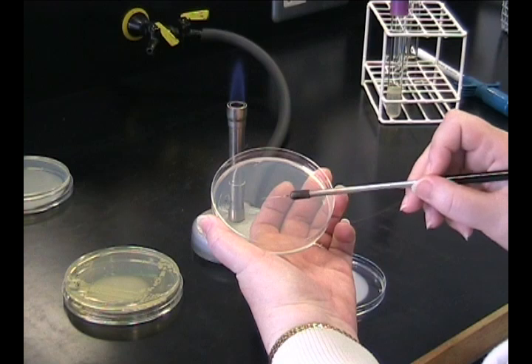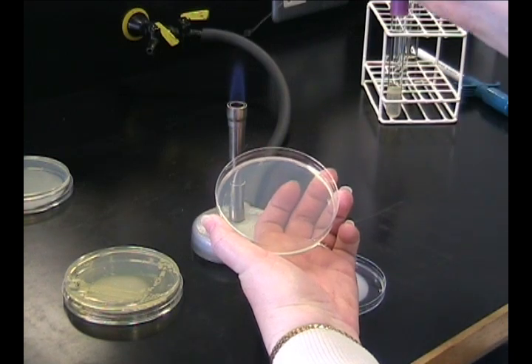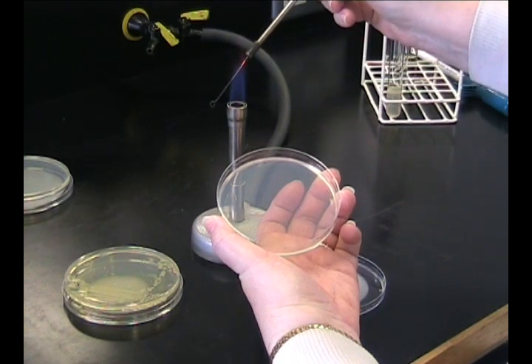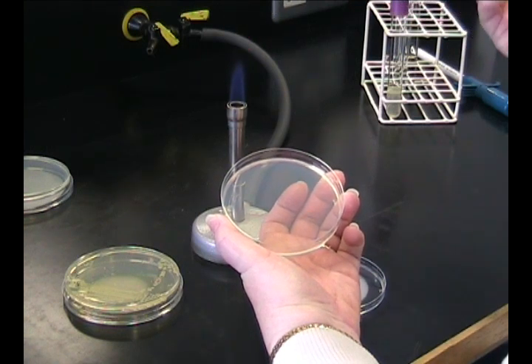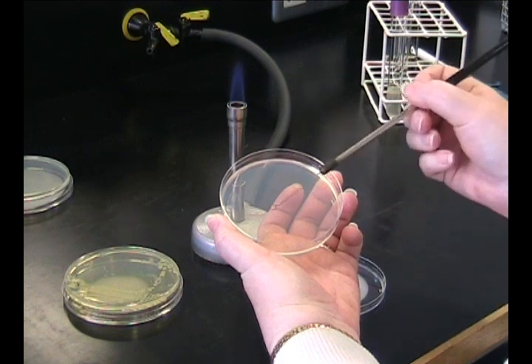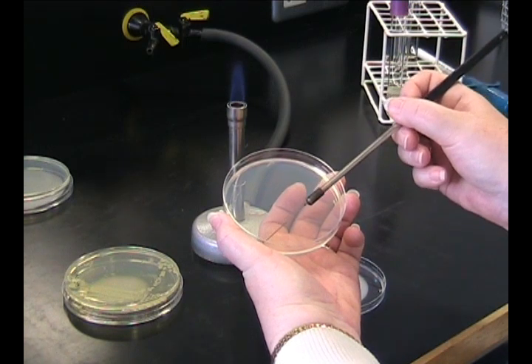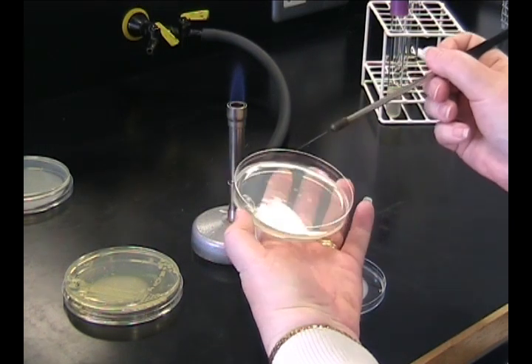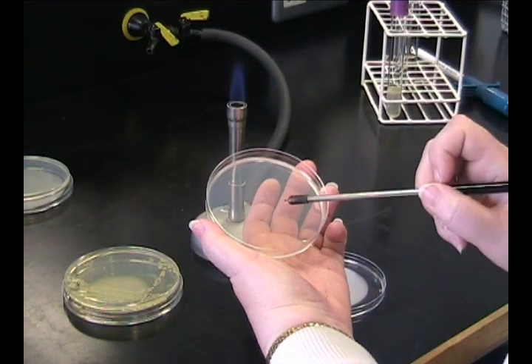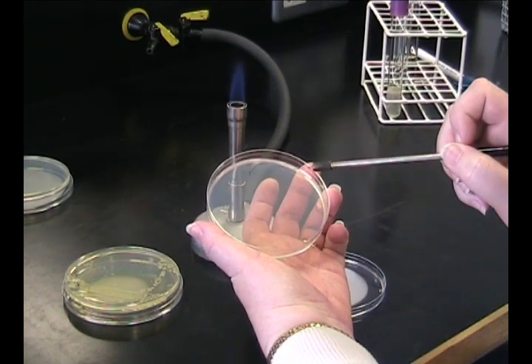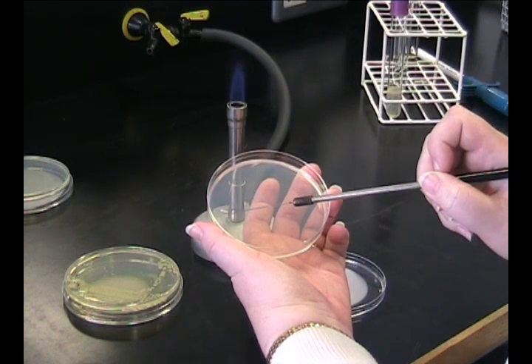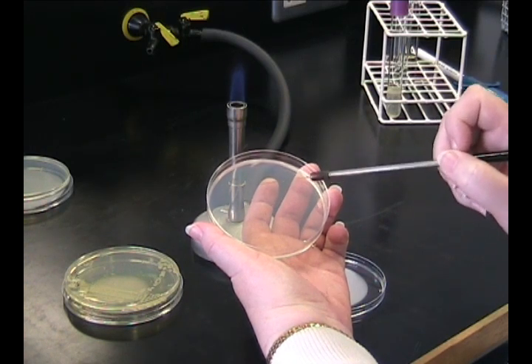It's important now to flame your loop again. Draw your loop slowly up through the flame to remove any bacteria from it. Cool your loop. If necessary, cool the loop onto the plate just to make sure it's cool. Then take one streak across the plate from this primary streak. Continue with three more streaks below it.